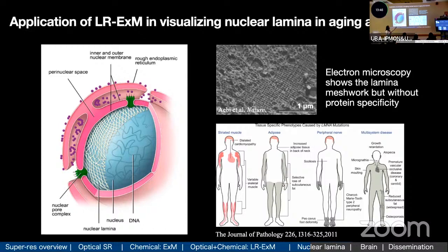So like these images feature all the lamin A mutation patients.